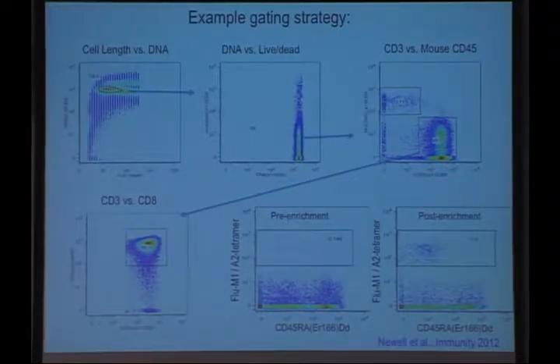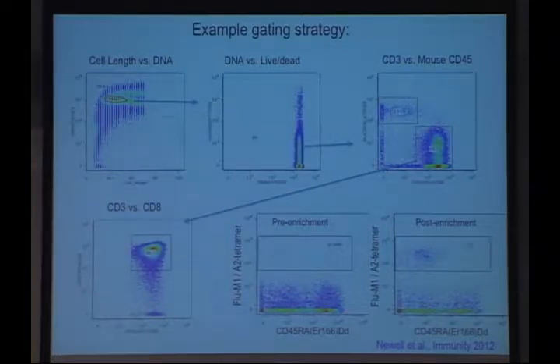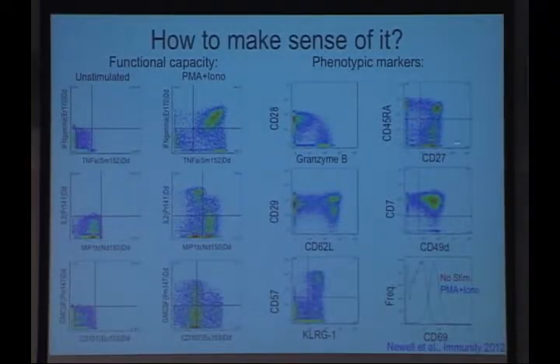Again, I showed this yesterday too, how we get these data, gating on the cell subsets. In this case, just very exclusively live CD8 positive T cells, and then also the antigen-specific ones when applicable. The challenge is, we can look at the data and make sure that we're happy with the quality of the staining for different markers, the surface markers here, and you can already see that there are certain subsets you can gate these cells into. This is one of the classical ones, the CD27 versus CD45RA array, which distinguishes basically 4 different types of CD8 positive T cells.